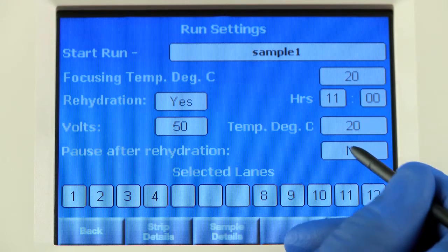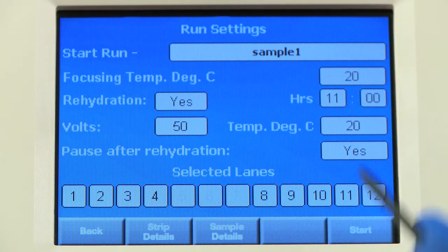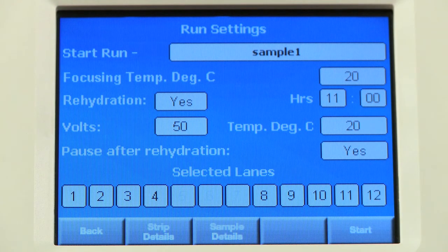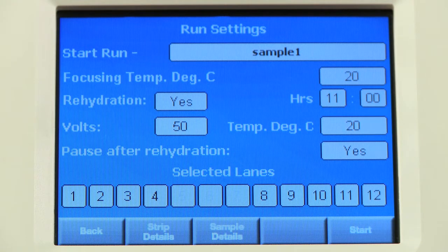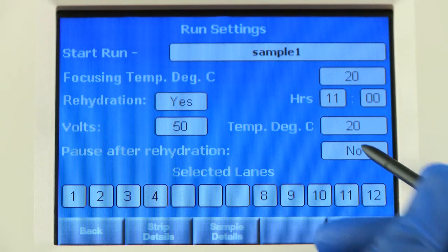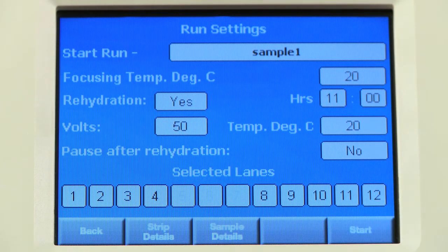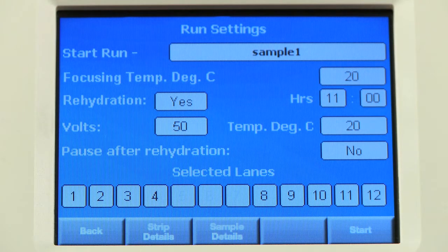You can also set a pause after rehydration if you would like to add electrode wicks before starting the run. If you choose not to use a pause, the focusing will begin as soon as the rehydration is complete.